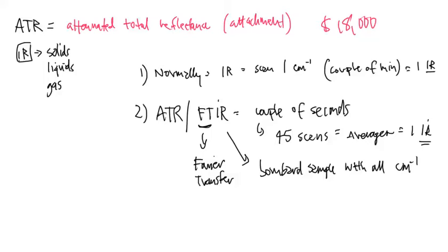It basically opens up the floodgates and allows all of it to go through. And the way that the FTIR is made is that it looks at all of these different movements and workout routines that are going on in the molecule at one time, and it produces a spectrum all at one time. It doesn't have to go through one wavelength after another in order to do its job.